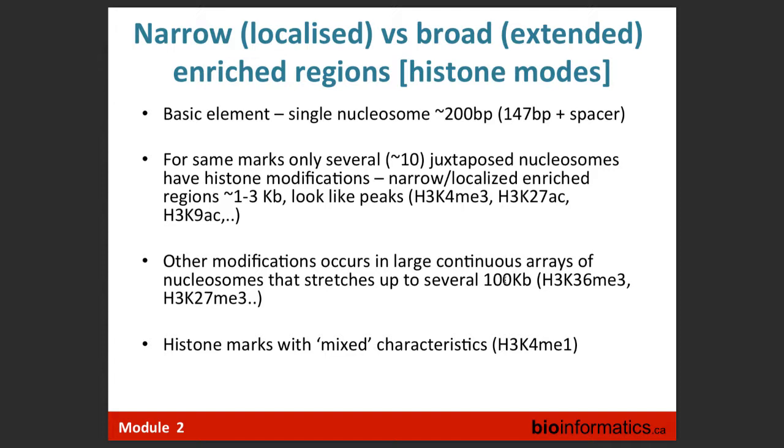Digestion and sonication. Now, this introduces bias as well. We know that actually the genome is not one string. It's wrapped in a very complex 3D structure. Some is heterochromatic, so it's very hard to sonicate, for example. So there are some locations which are hard to sonicate.